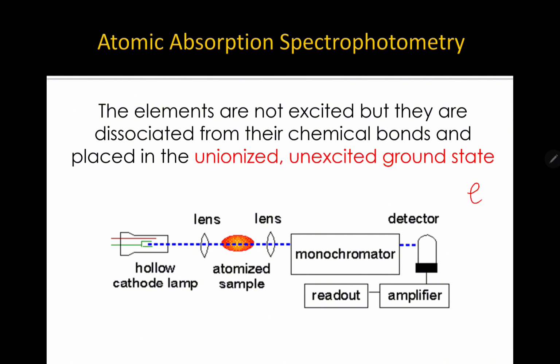Dito sa atomic absorption spectrophotometry, hindi mo hintayin na maging excited yung inyong electron, but rather send lang ng energy, ng light source, sa inyong electron, okay? Yung amount of light na na-absorb niya before siya ma-excite, if ma-determine natin yun, therefore we can do a quantitative determination of the amount of analyte. Nagets ninyo? Because you can clearly see how much light ang kanyang na-absorb before siya ma-excite.